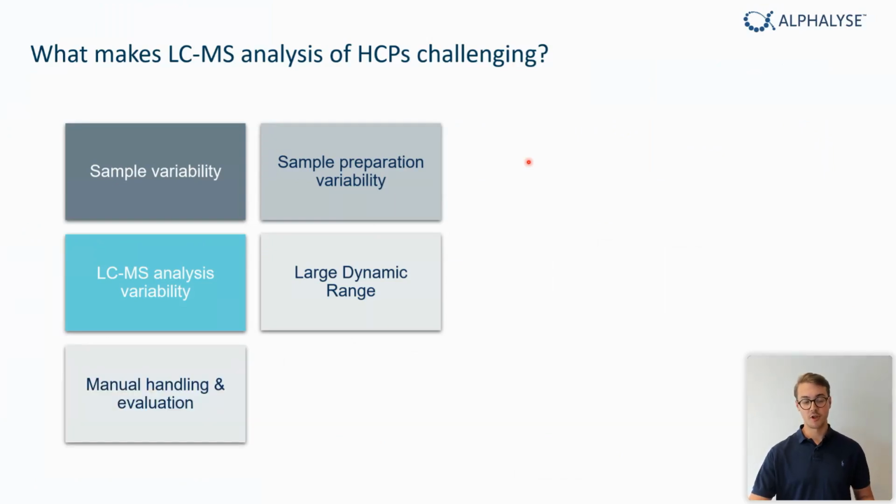And then there's this manual handling and evaluation element. So as soon as you're handling any sample or anything, then you have the opportunity to introduce errors. So this is also something you really need to consider and automate as much as possible.